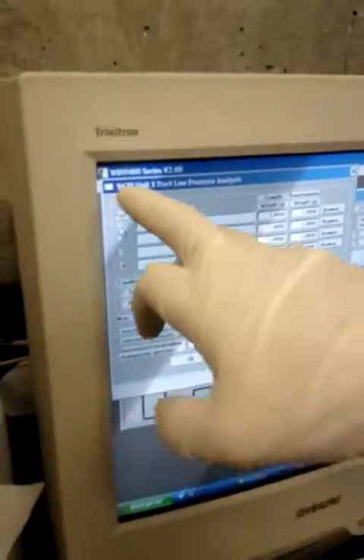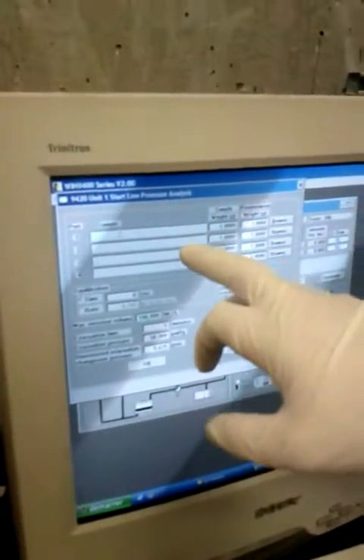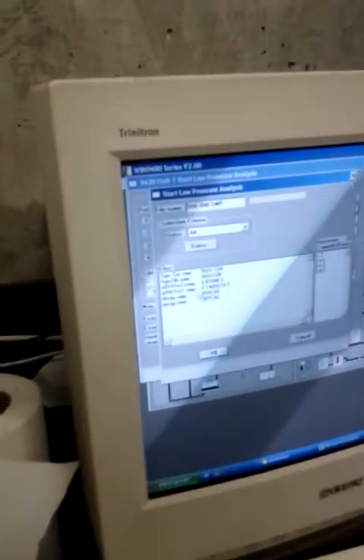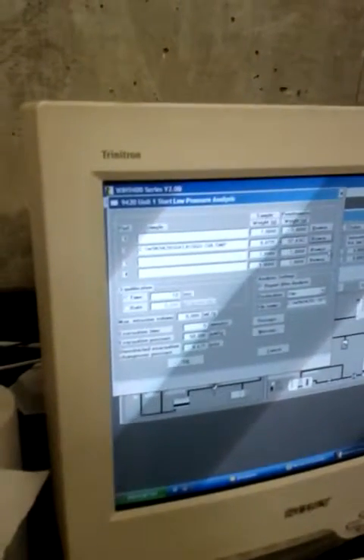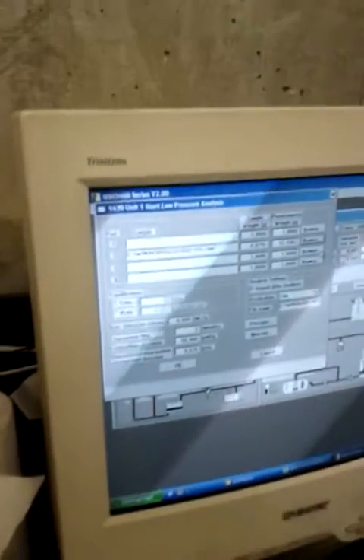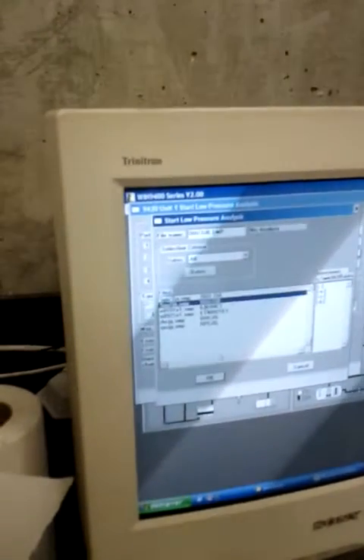Now we will make the low pressure test. So we come here on the sample. We go in the analysis menu, low pressure analysis, and here is the port, and we will browse for the sample in port 2 and port 3. In port 2 we will have this sample. That's why it's very important to note clearly what sample is in which penetrometer measure. This one. Okay, so we have our two samples.